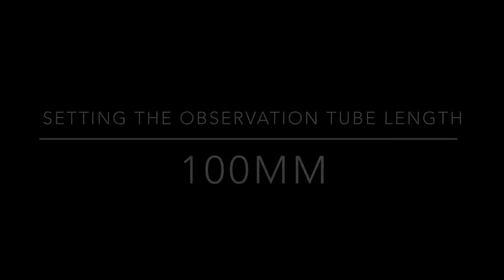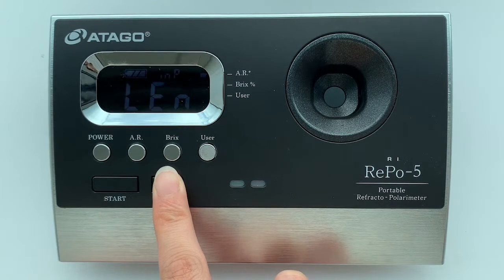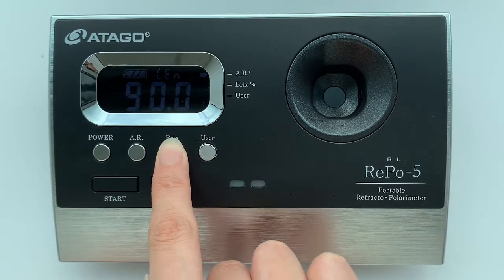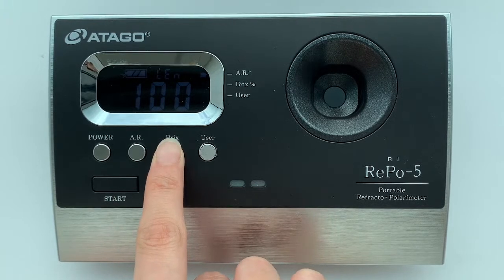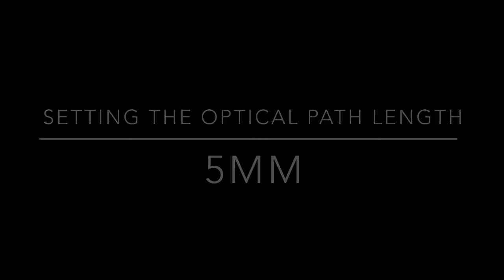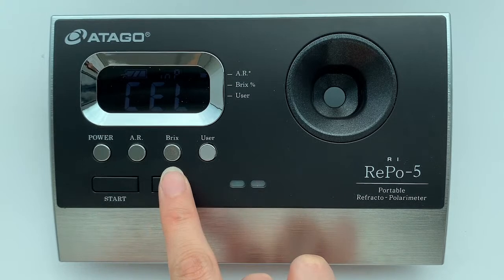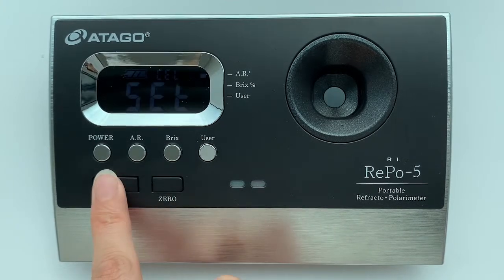Now we set the observation tube length. The factory setting is 200 mm, but today we are using 100 mm, so we need to change that. Press fix to change the number to 100 mm — setting done. Next, set the optical path length. The factory setting is 20, and today we are using 5, so we set that to 5 — setting done.